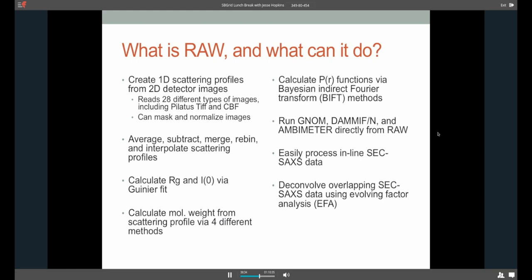You can mask and normalize these images and then use that, calibrate them, use that to turn it into one-dimensional scattering profiles. Once you have those, as I said, you average, merge, subtract, re-bin, interpolate, all the kind of standard things you'd expect you might need to do on these profiles. You can calculate RG and I0 from the Guinier fit. There are four different methods for calculating molecular weight. There's two different ways to get the indirect Fourier transform, a Bayesian approach, and then the regularization parameter approach implemented in GNOM by the Svergun group. It can also run GNOM, DAMIF, DAMIN, AMBimeter, DAMAVER, several other things directly from within the program, so you don't have to save your data out, go to the command line, run these bits. It'll do all that for you, including a bunch of the advanced features.